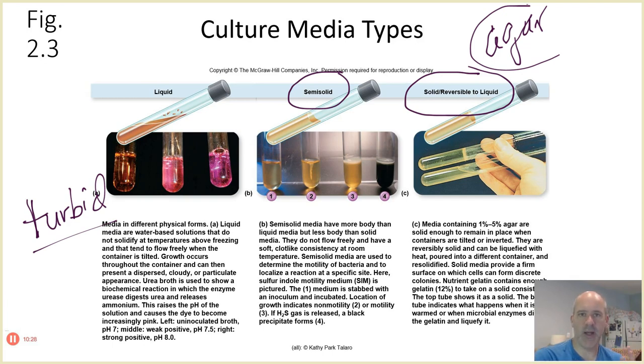And agar is much the same way. So you have to boil it to get it to dissolve and go into solution. And then as that agar solidifies, it creates a solid type of culture medium surface. Nice thing about agar, so with Jell-O, traditionally in microbiology laboratories, gelatin was used as the substance to give you a solid surface on which to grow microorganisms. But a lot of microorganisms can actually break down gelatin or liquefy it. But most microorganisms don't break down agar very well. It's a complex polysaccharide, again, that actually comes from seaweed.